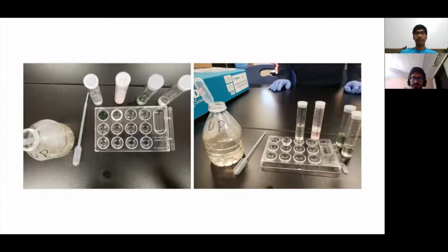And next to the nitrates to the right is phosphorus. And the lighter green color is indicative of phosphorus, but in a small concentration. And to the right of that, the last calibrated tube was sulfites. And we found no sulfites in the Passaic River water upstream.